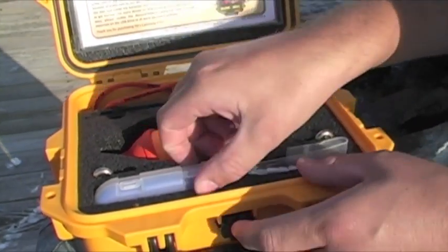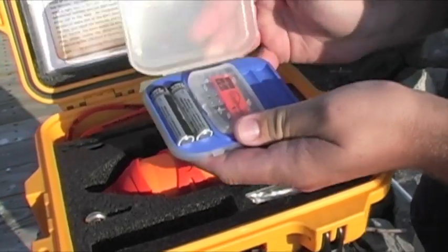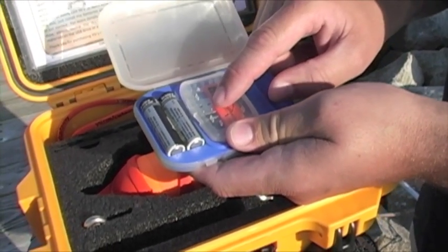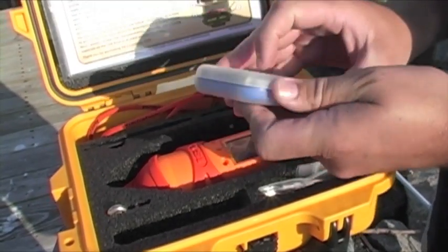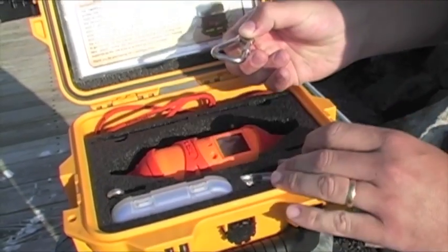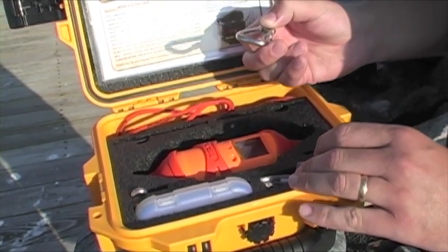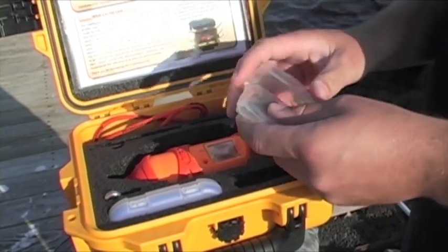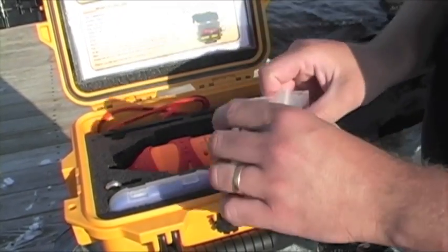Inside the box you have everything you need to get going. There's a handy pack with the memory stick that has all the software on it, the Bluetooth modem, which is a USB modem, and spare batteries. You have carabiners that go on the top and the bottom of the instrument — on the top for putting your line for retrieving it after you cast it, and on the bottom if you want to add some weight to have it fall a little faster. And you have a maintenance kit for your sensors, brushes, lubricant, and O-rings.